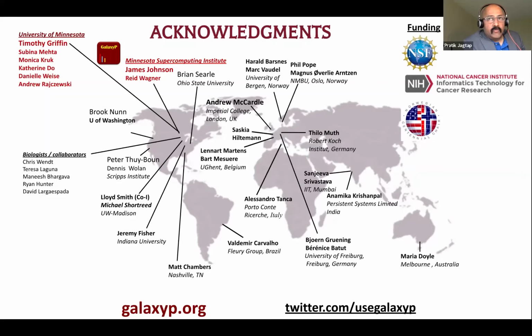The Galaxy Europe web server is a pretty good resource wherein most of our workflows and tools are available, and it has a decent amount of memory or storage that one can use to perform project analysis. So that's what we have been doing within the university.